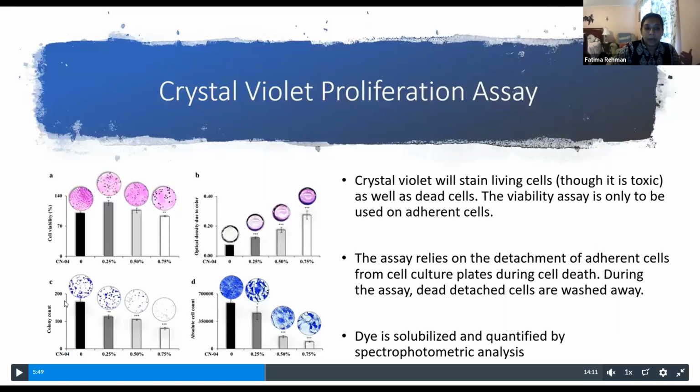Here you see, in the untreated and with the zero concentration of drug, you have a lot of colonies all throughout. In the low concentration, you still have some colonies, and some are really large as well, but they are significantly reduced. They're beginning to show significance. And then with each increasing concentration, you see less and less colonies. So this particular drug, which we're showing the effectiveness of in this way, can reduce the tumorogenicity of a tumor or a cell line by giving them this drug.